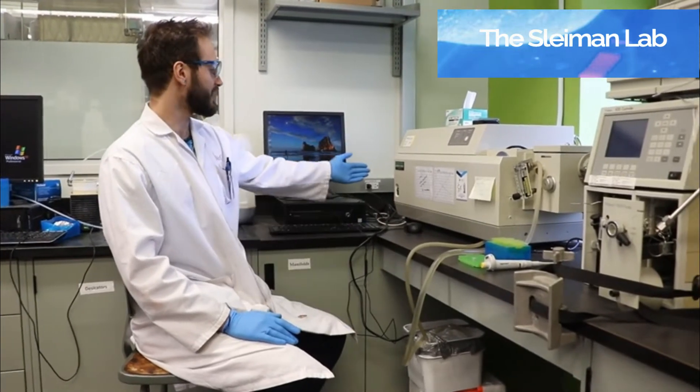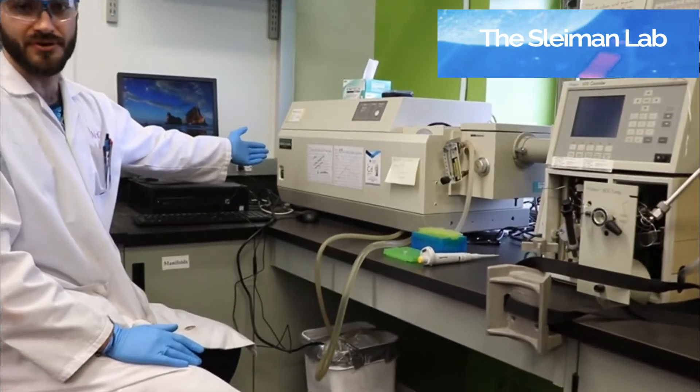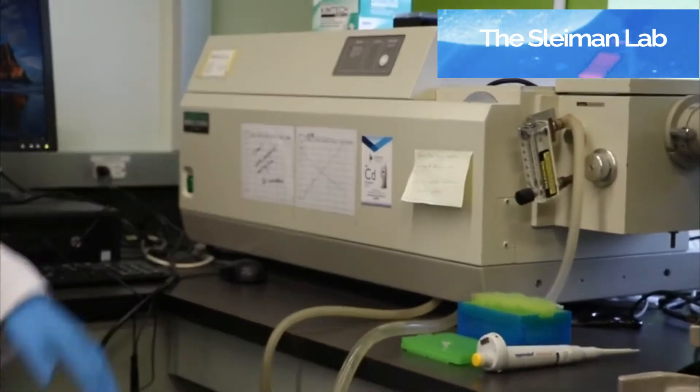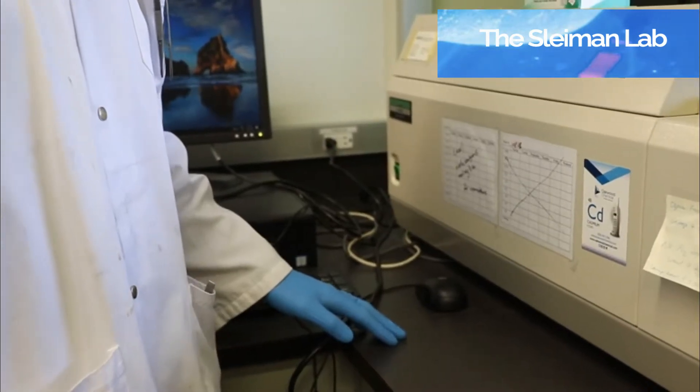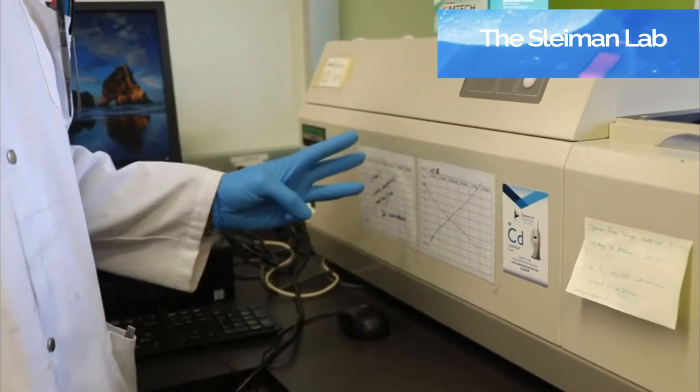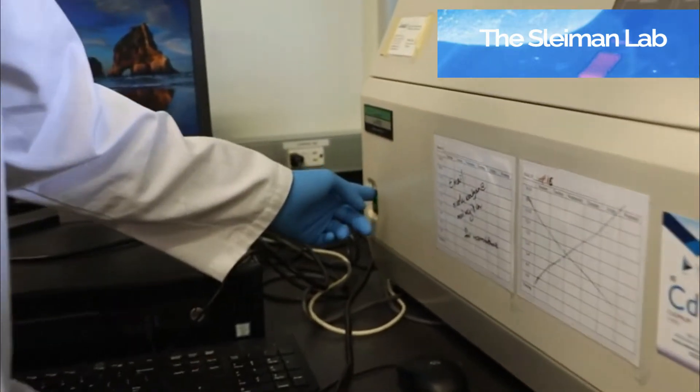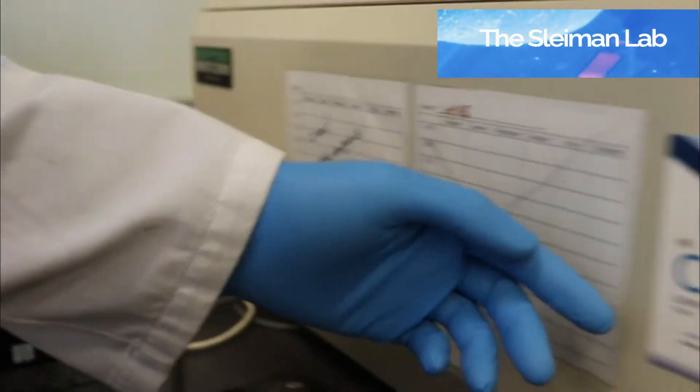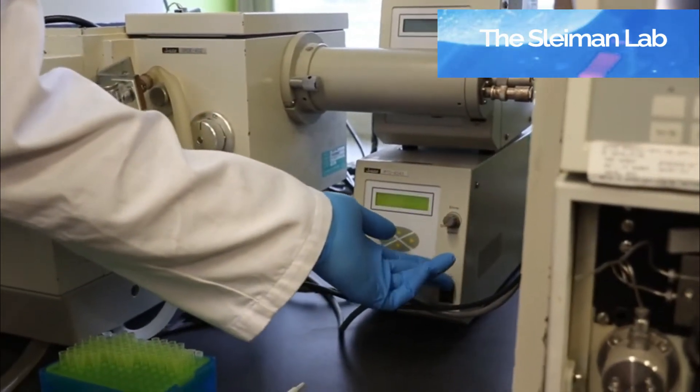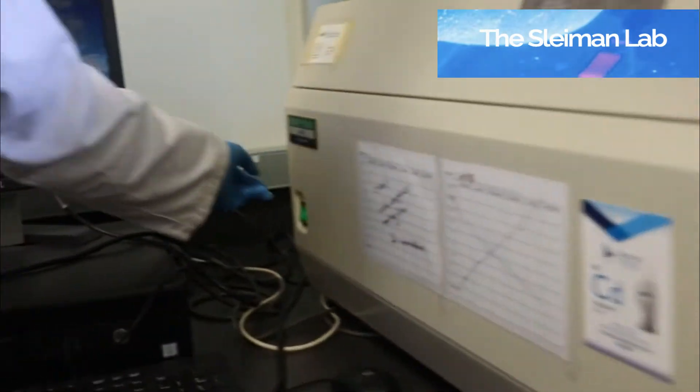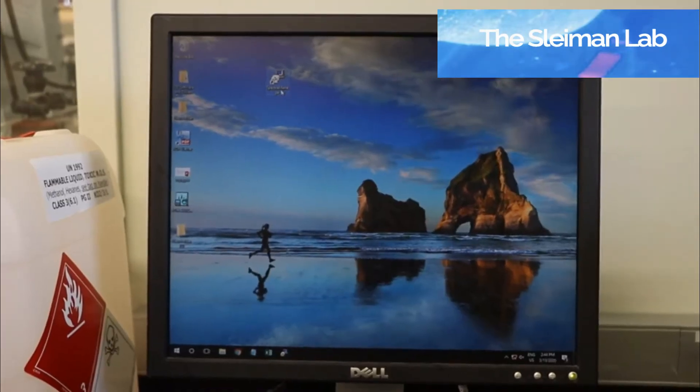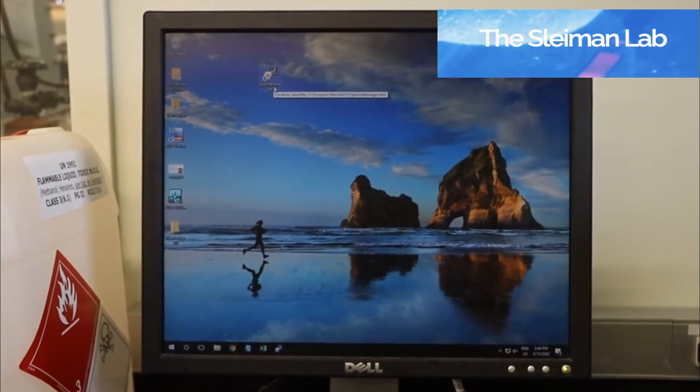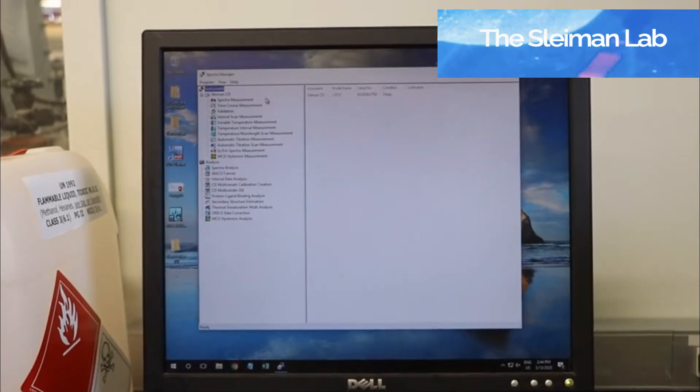We will be working with the Jasco 810 Spectrophotopolarimeter and the associated software today. So first, we need to open the machine. There are three steps to it: the actual instrument, the temperature controller, and the pump. Then we go on the Spectra Manager software, which you'll install when you get your machine.